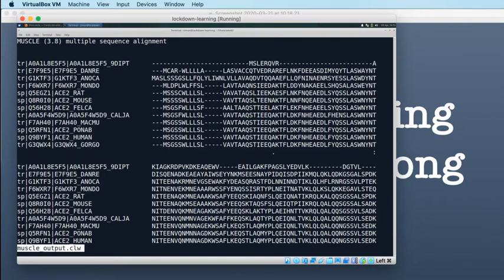And you can see that we have managed to build a multiple sequence alignment. That top sequence, the one which I think might be a mistranscribed ID, you can see really isn't aligning very well at all to the rest. Whereas all of the others seem to align okay to each other. There is one other outlier a little bit. This G1 is a little bit different.